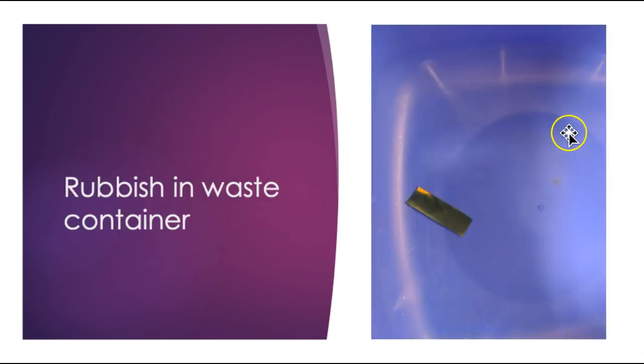Make sure that you dispose of any rubbish into your waste container, please. And that container has to be cleaned at the end of your prac, so any mess you make, you need to put it in there and clean it up.